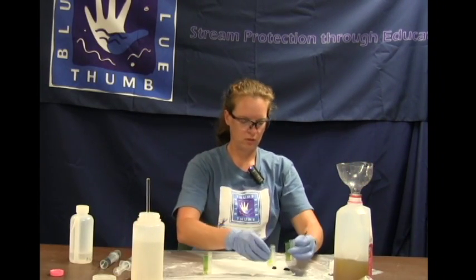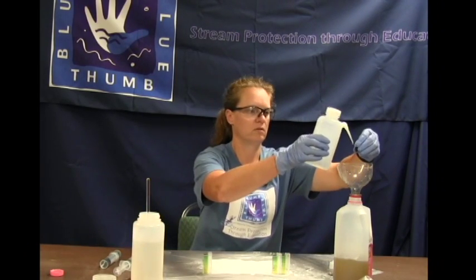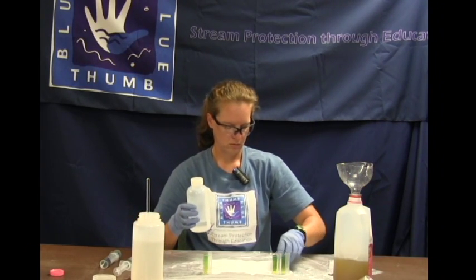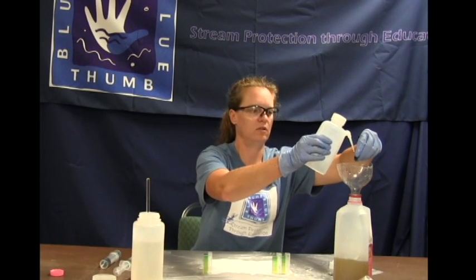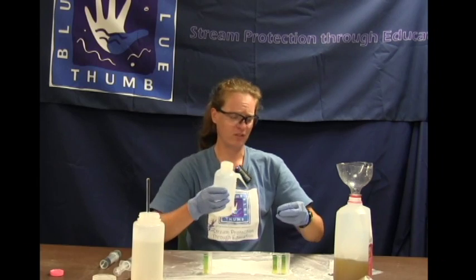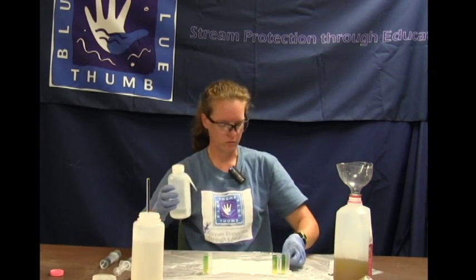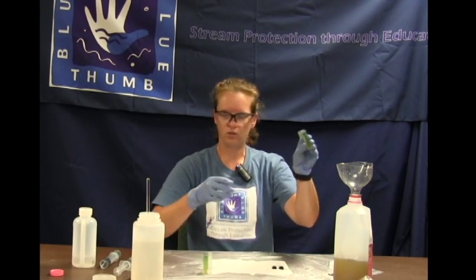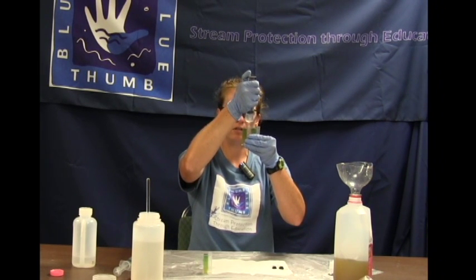Just shake off the extra, and we also need to rinse off the caps as well. Rinse these separately. You don't ever want to drop your cap in the liquid waste. It's pretty nasty when you got to go fishing for it, but it happens, and we do want you to keep all of your equipment, so don't flush it down the toilet. Okay, so these 2 need to be filled with creek water up to that dashed line as well.